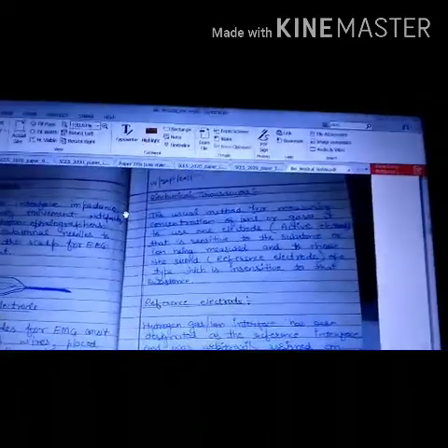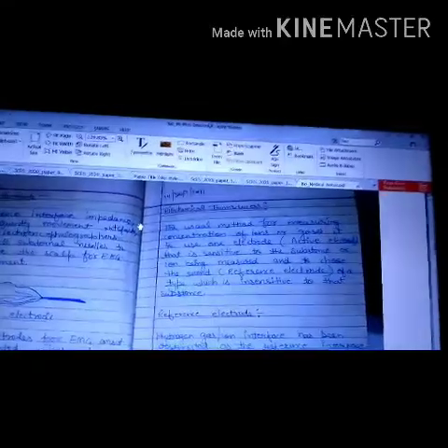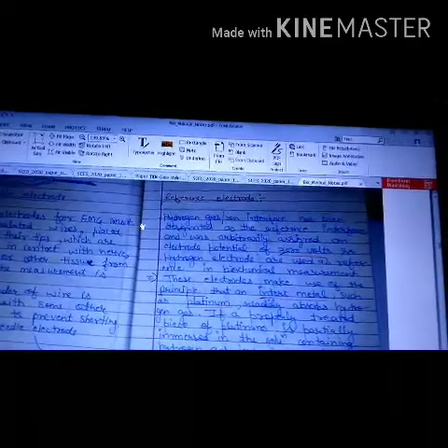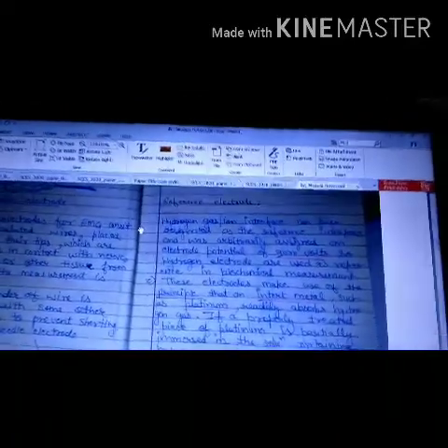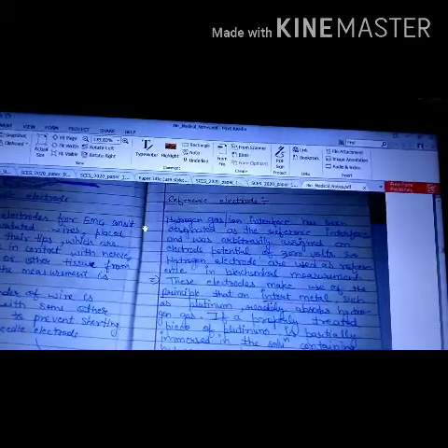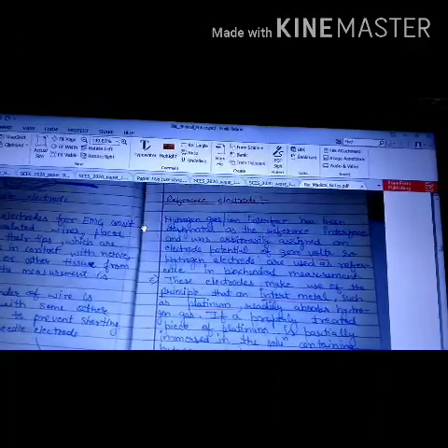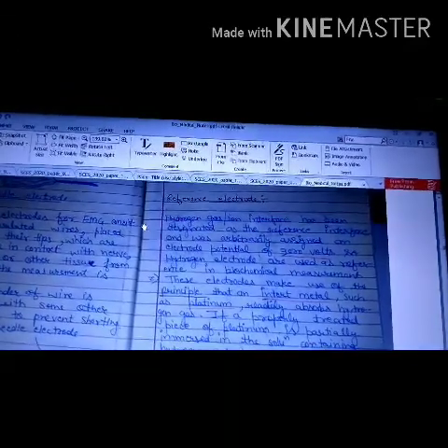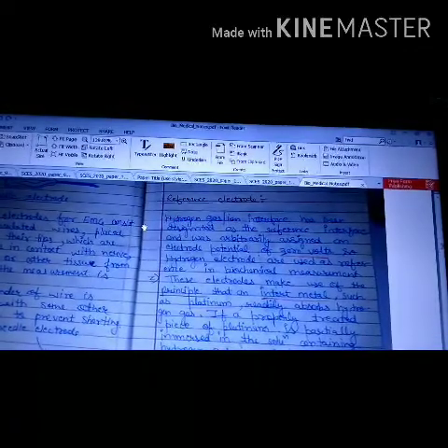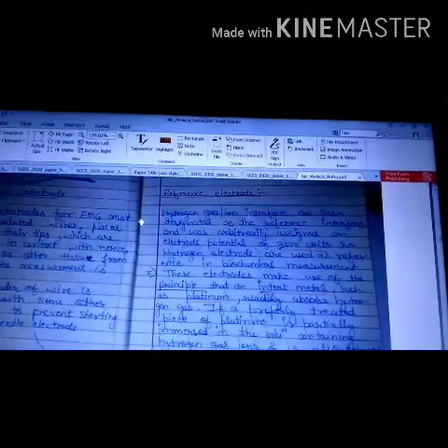Previously we had discussed that the reference electrode is normally made of hydrogen, which was a standard utilization. So the hydrogen gas or ion interface has been designated as a reference interface and was arbitrarily assigned an electrode potential of 0 volt. So hydrogen electrodes are used as reference electrodes in biochemical measurement. However, there are some disadvantages related to this type of electrode.